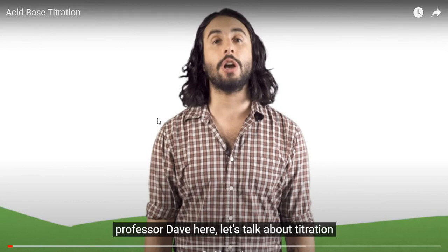Okay, so that is how you perform your titration. So next is just an illustration. So here is one more example for our acid-base titration, from YouTube, and also the link is in our module.